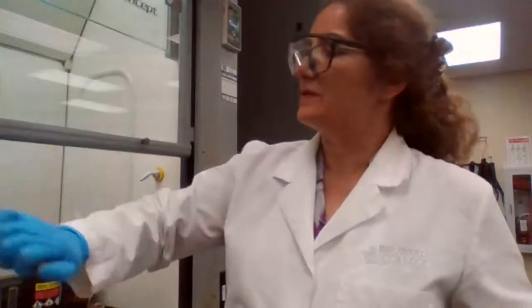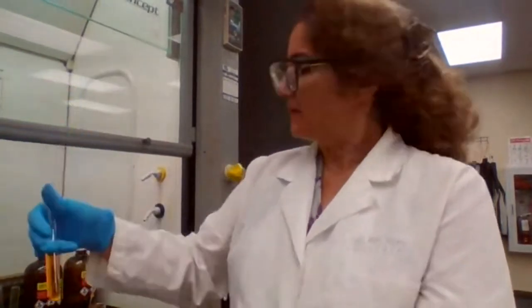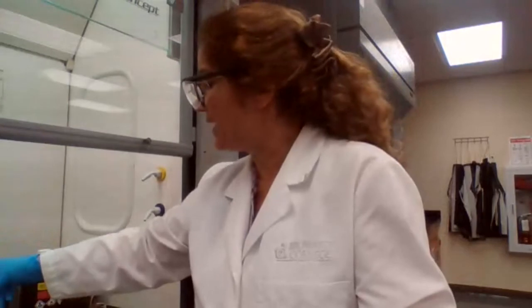The acetophenone did not show precipitate. I have to search into this to see why acetophenone is not giving me precipitate. This acetophenone has a methyl and a phenyl group attached to the C=O double bond. Maybe with the aromatic ketone it is not showing, or the reaction is much slower, and sometimes it requires heat. So make sure you report the acetone for the iodoform test for positive.